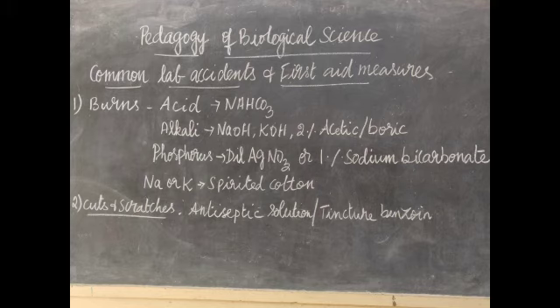Any laboratory should have a carpet or a rug in case of fire accidents, and there should be a bucket full of sand kept in the corner of the laboratory, a fire extinguisher, a first aid box, an asbestos sheet to prevent fire, and the doors of the laboratory should not be locked when the students are inside the laboratory.